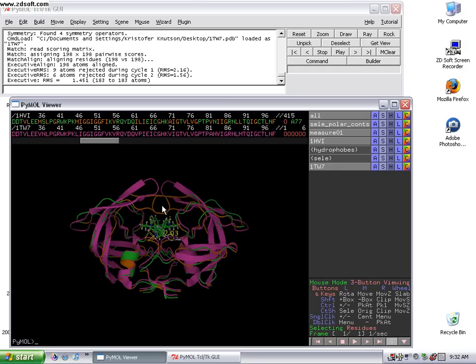Usually when you compare two homologous proteins, even if the sequence is quite a bit different, the structures will usually align up pretty well. You won't see a ton of difference in my experience, but here, in this particular case, you will see quite a bit of difference.